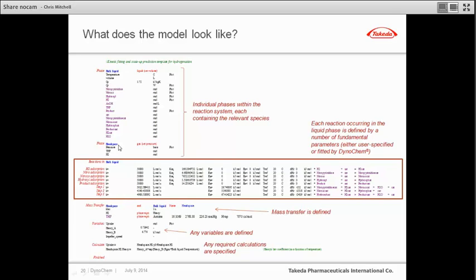The headspace contains simply hydrogen gas and an amount of THF vapor as defined by the Antoine equation. Within the bulk liquid, we have a number of reactions that are occurring. We have the 5 individual adsorption-desorption equilibria, and we have the 3 fundamental chemical steps.